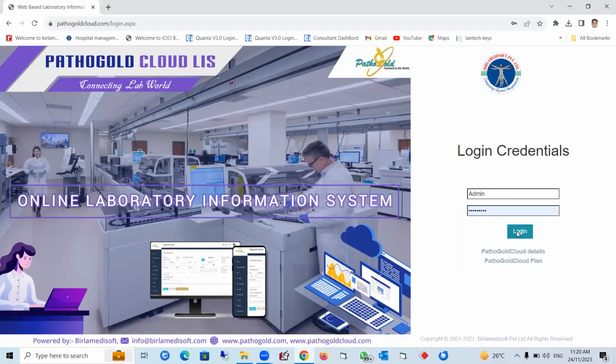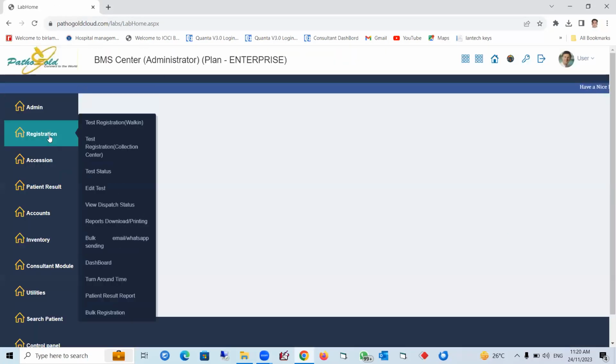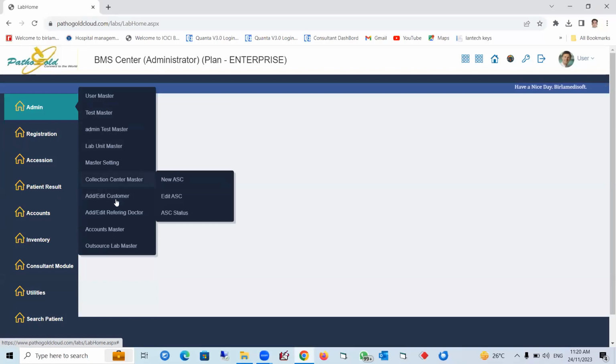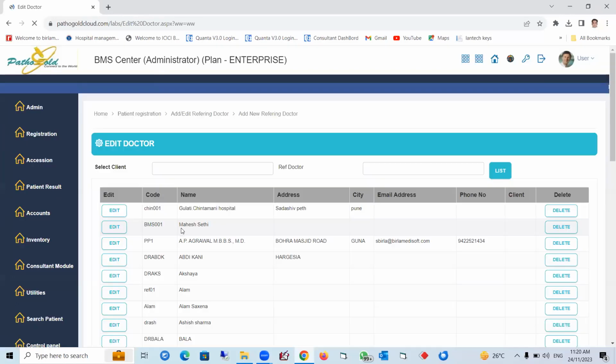Okay, let's log into the system and go to the defining of the referring doctor. When you define a referring doctor, you will see that a referring doctor gets a username and password. Let's say I define one referring doctor.